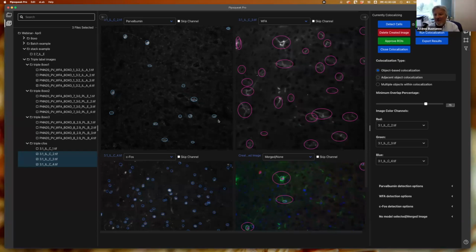And nobody else has got another question? Can I ask another question? Feel free, yeah. Then also, with regard to the Z thickness, what is your recommendation? Because that also makes a difference to defining localization.